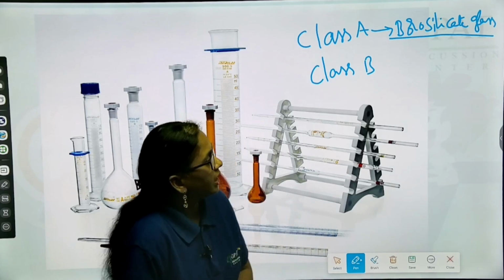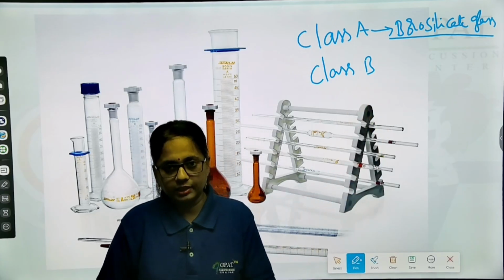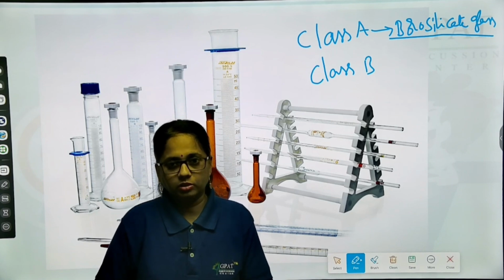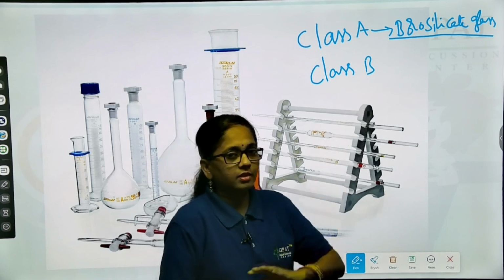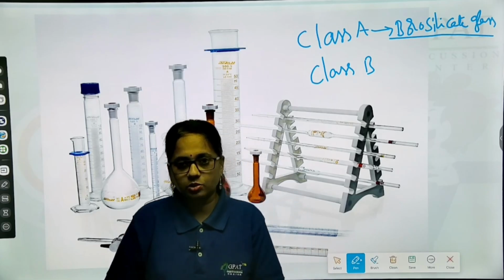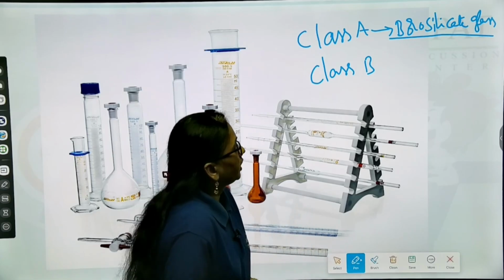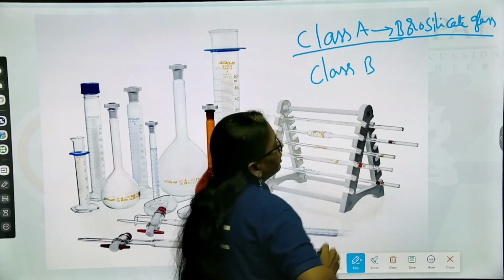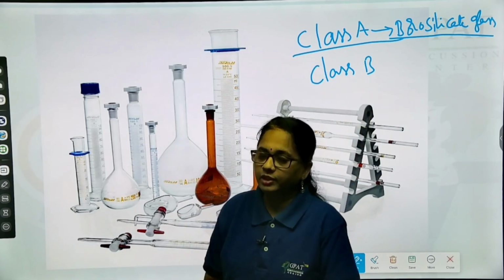So for this borosilicate glass, the thermal expansion coefficient is at the required level. Okay, so that's why this is the highly preferred glass for the manufacture of all the laboratory glasswares.